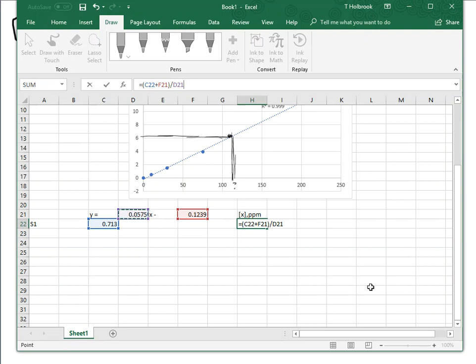Again, if there's anything else in there besides the number, Excel doesn't know what to do. That's why I only put the number in the cell, and that's it. All of the variables, everything else, don't put them in there. Excel won't know how to handle it. Then I'm going to hit enter, and I get 14.55 as an answer.